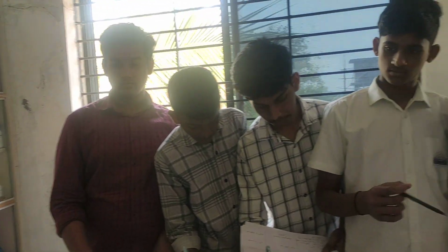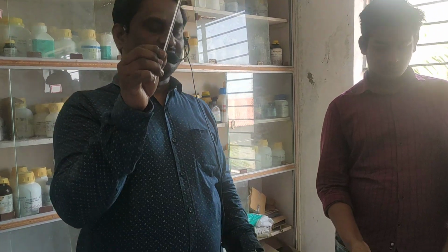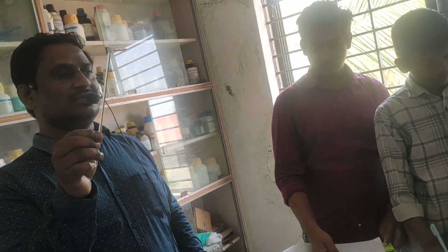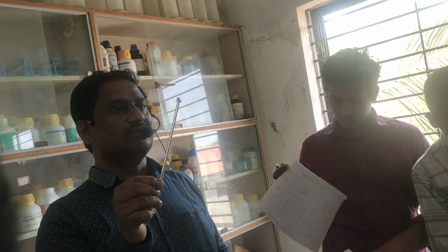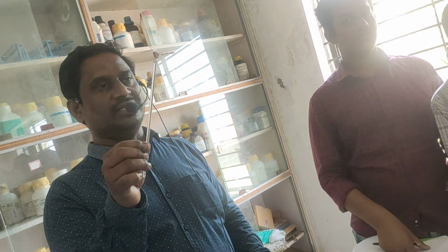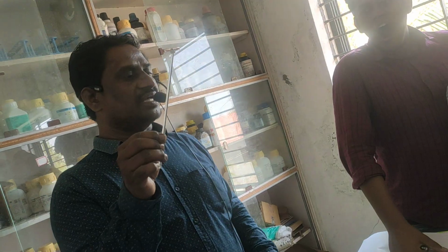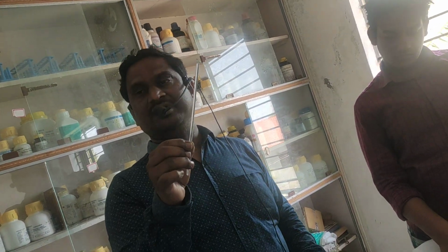Last, you have to write the result. Acid radical or anion: CO3 minus 2. Next, basic radical or cation: Ca plus 2.